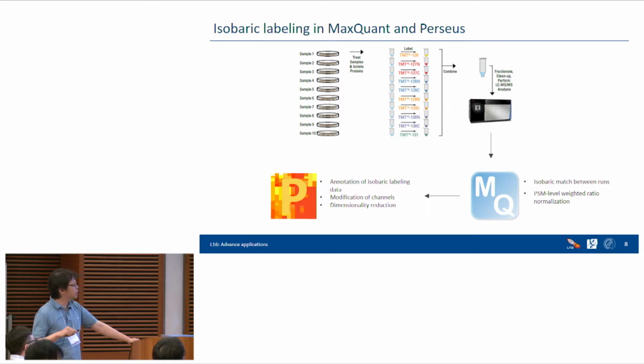They also saw that at the protein group level, more than 50% of the proteins lose at least one sample value, but in TMT, they can recover it. And if they calculate the number of proteins which have at least two values at the protein group level, TMT has 2 times more than label-free quantification.